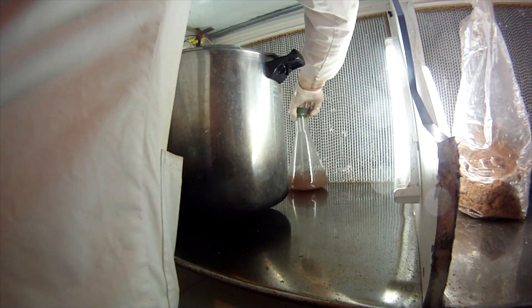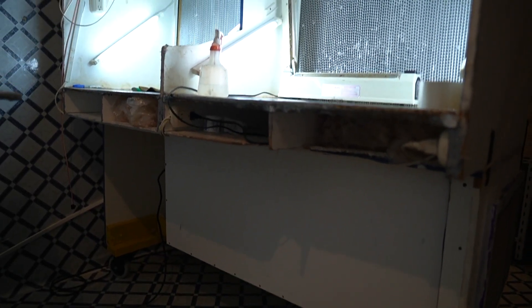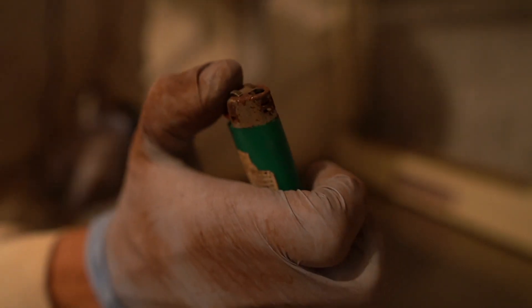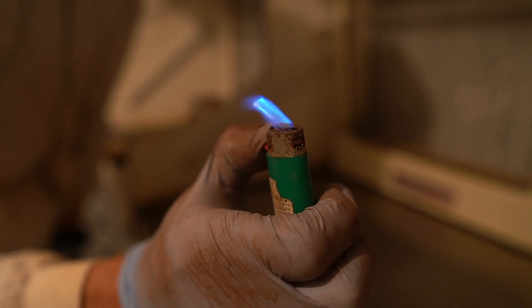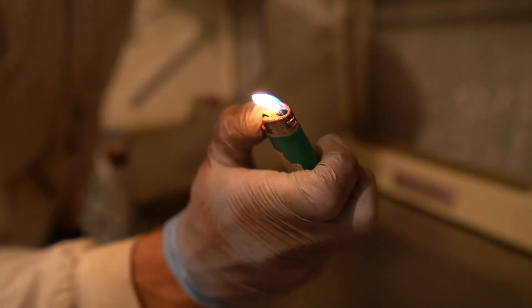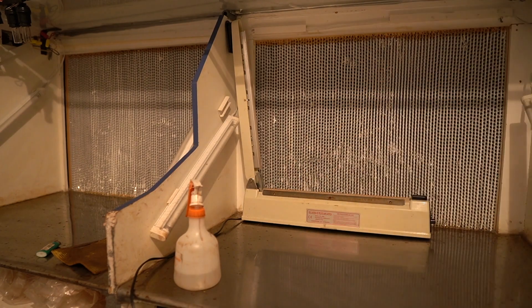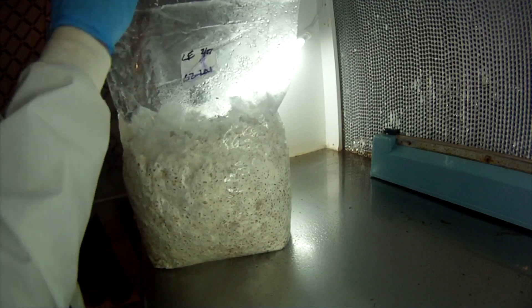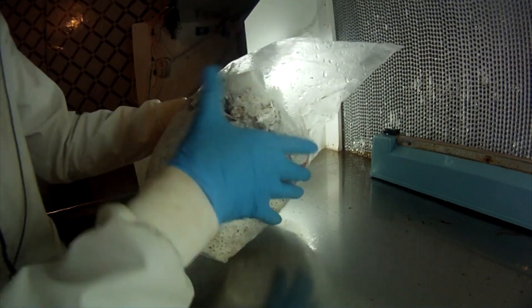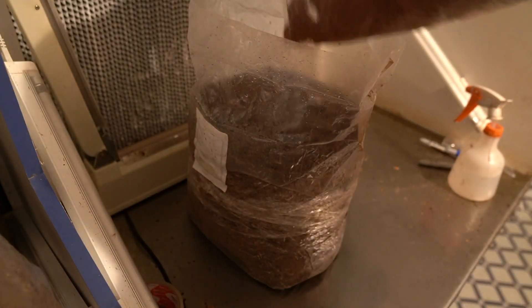Basically, laminar flow is a fancy scientific term for parallel air currents flowing parallel to a surface. The important thing here is that the air is being pushed through extremely efficient particle air filters — 99.999% efficient to be exact — so it's essentially sterilizing the air, giving you a clean space to work with.